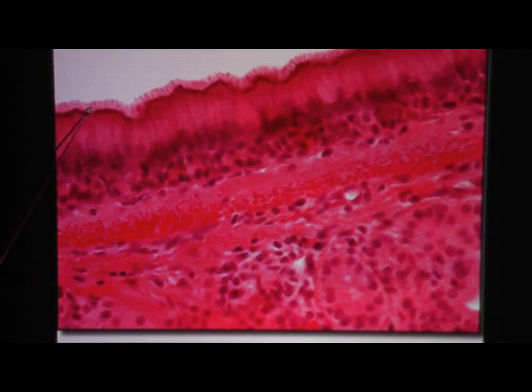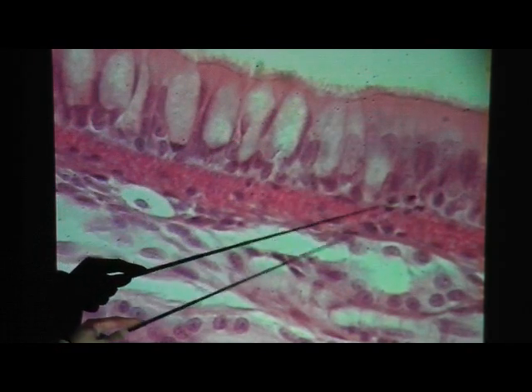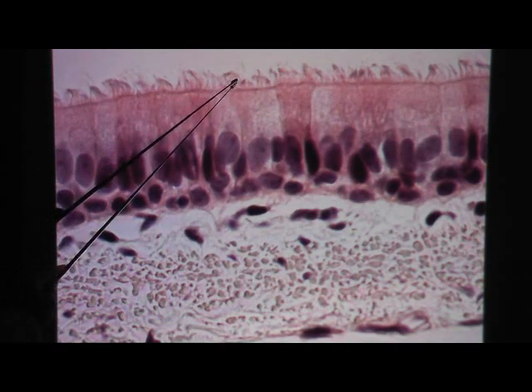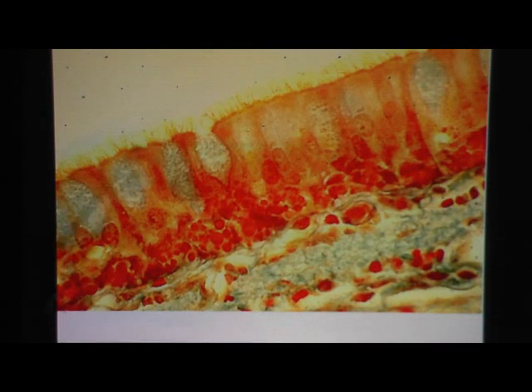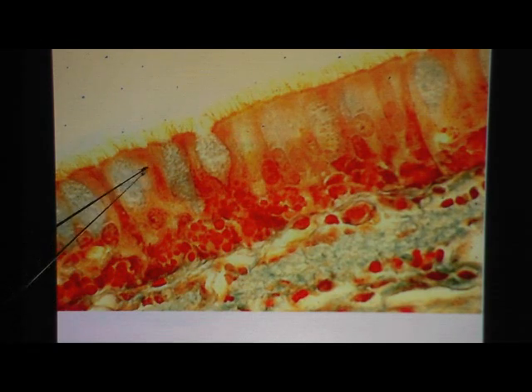Looking at additional views of the same tissue at various magnifications: ciliated pseudo-stratified columnar epithelium. In one picture you can see some clear goblet cells. And that's it.